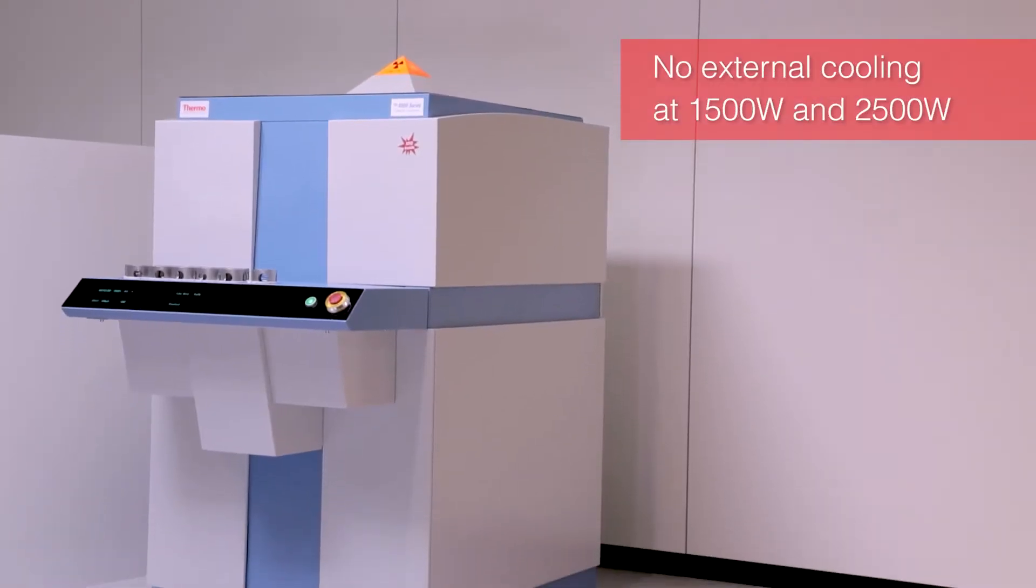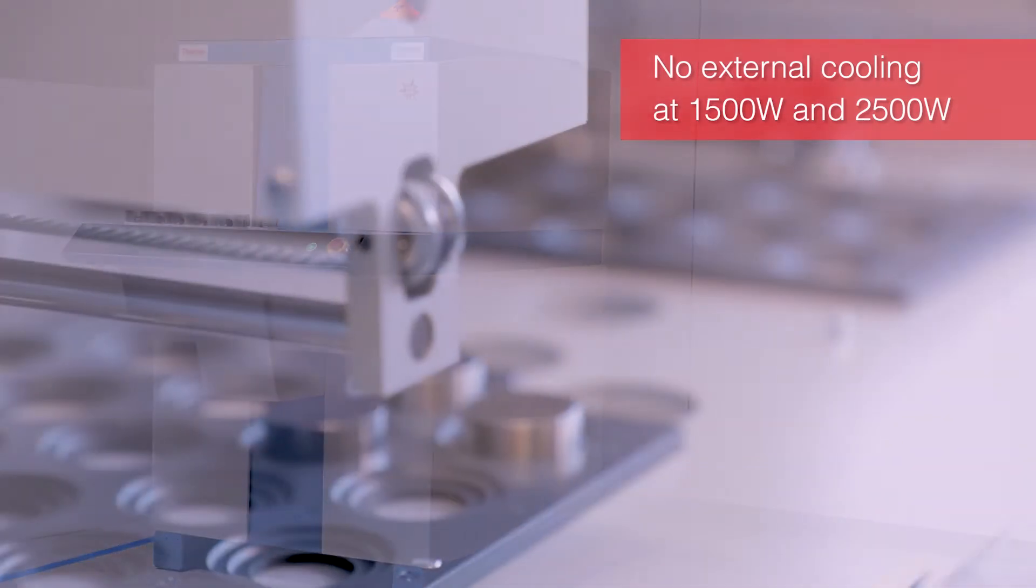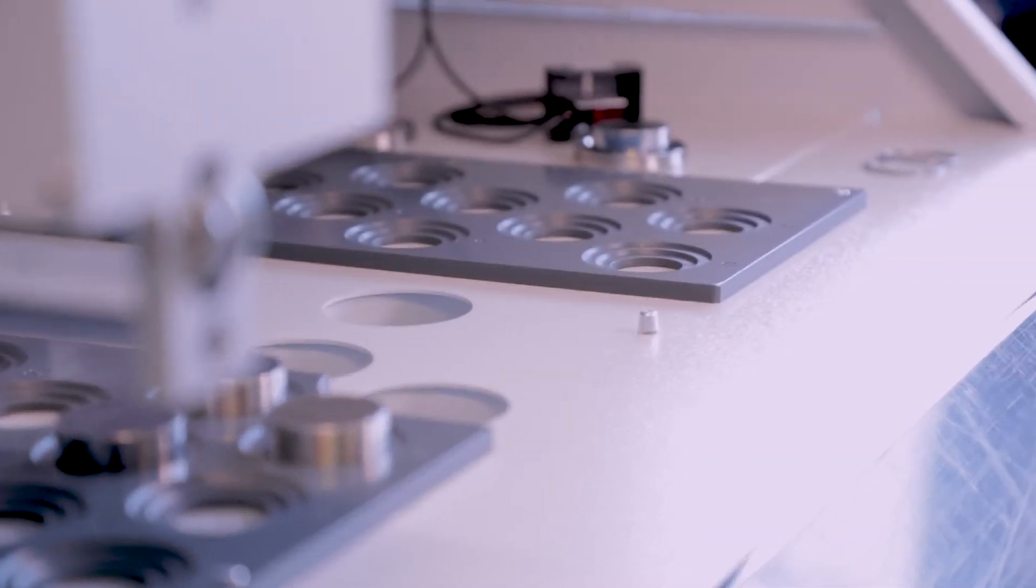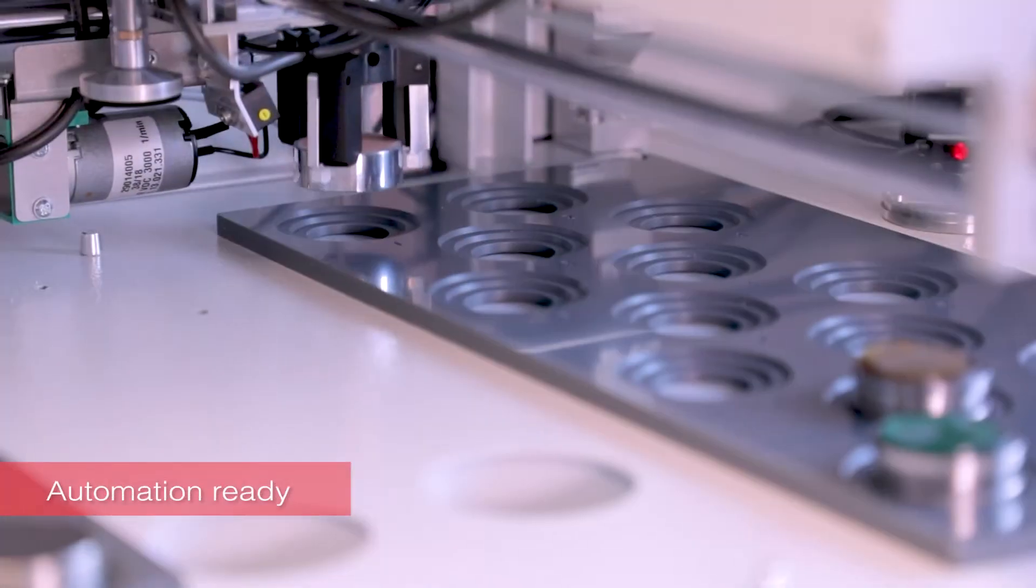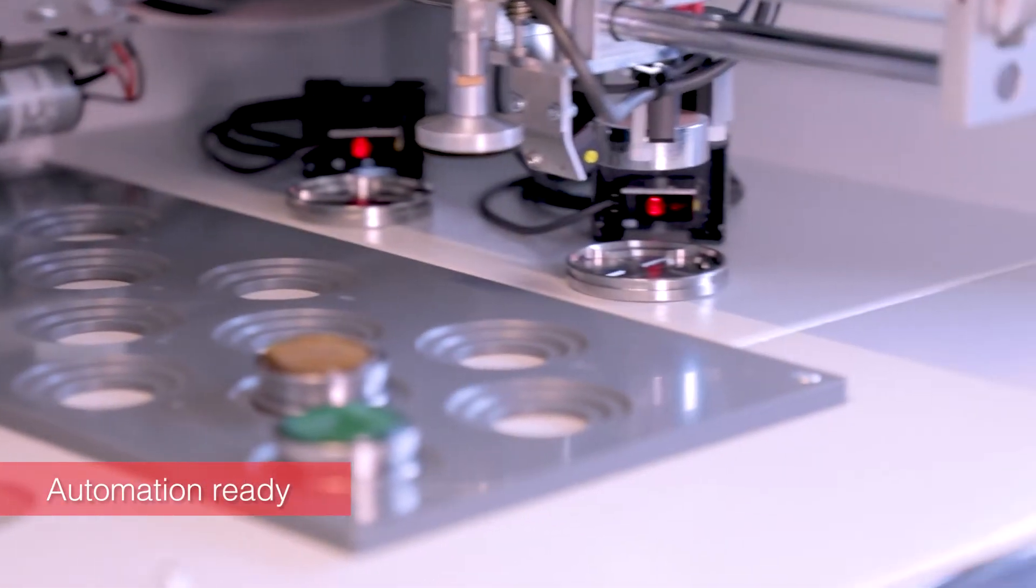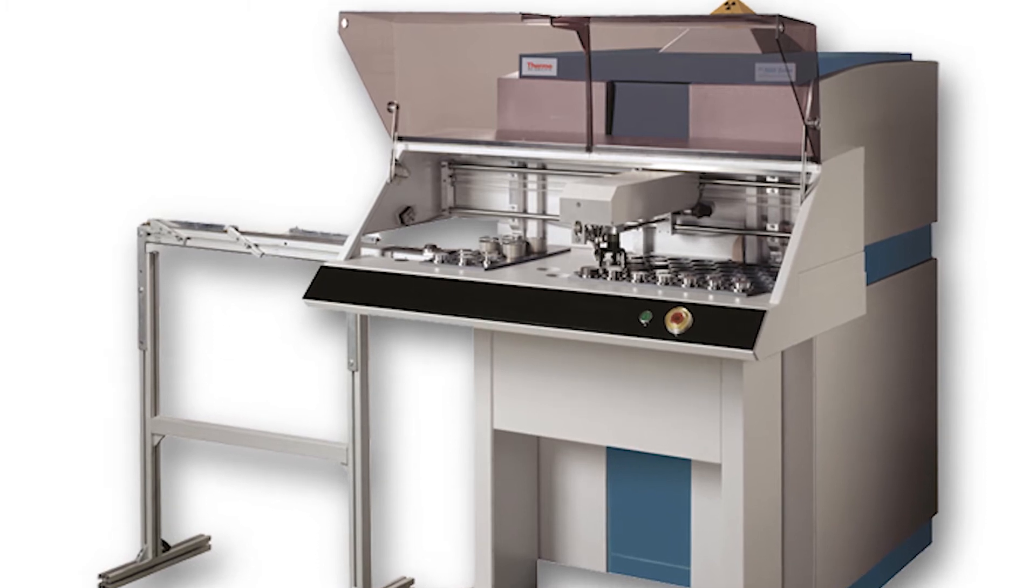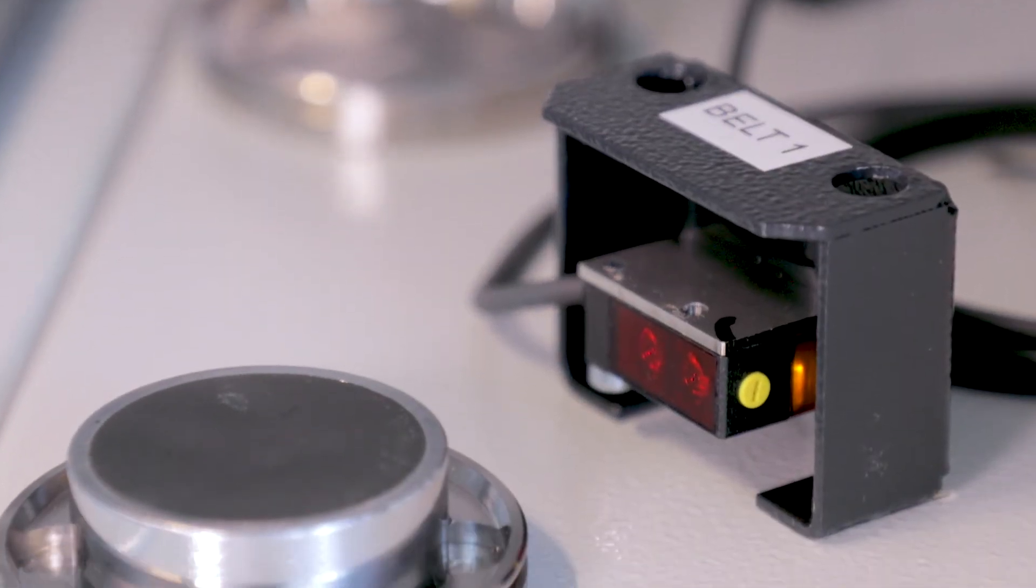Installation requirements are straightforward and can be easily accommodated in most industrial environments. A high degree of automation and digital control make the ARL 9900 easy to use. It can be programmed to conduct continuous process monitoring in unattended mode, with direct connection to automatic sample preparation machines.